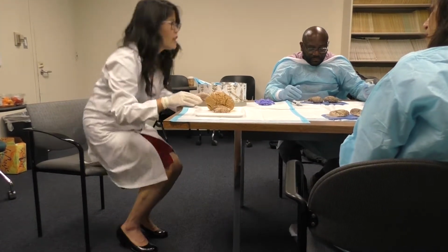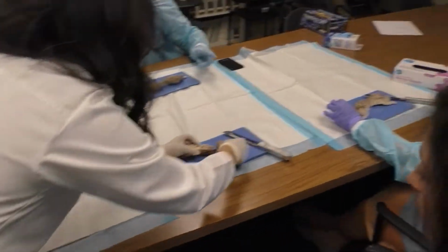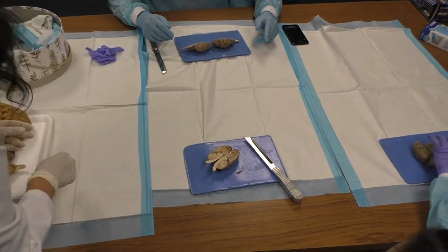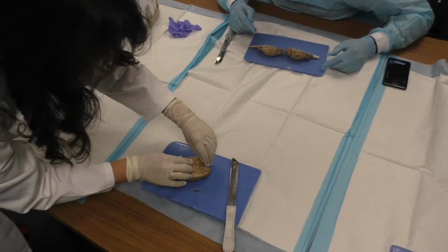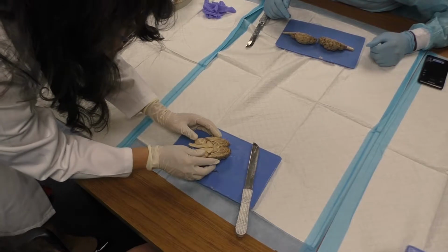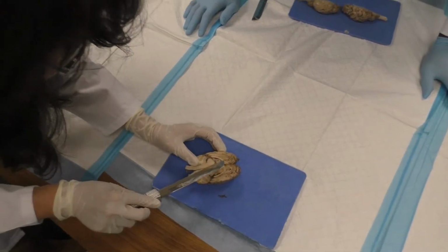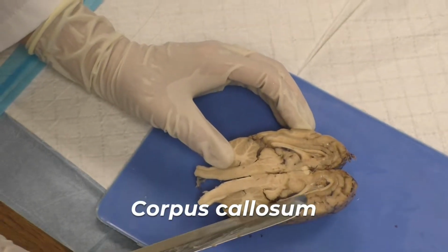Okay, so let's take a look at these structures. We'll do each brain individually, and actually maybe I'll do it once, and you try to identify the same things. So this is a beautiful specimen, because look at that. See this white band here, and then it goes down. This is the corpus callosum.